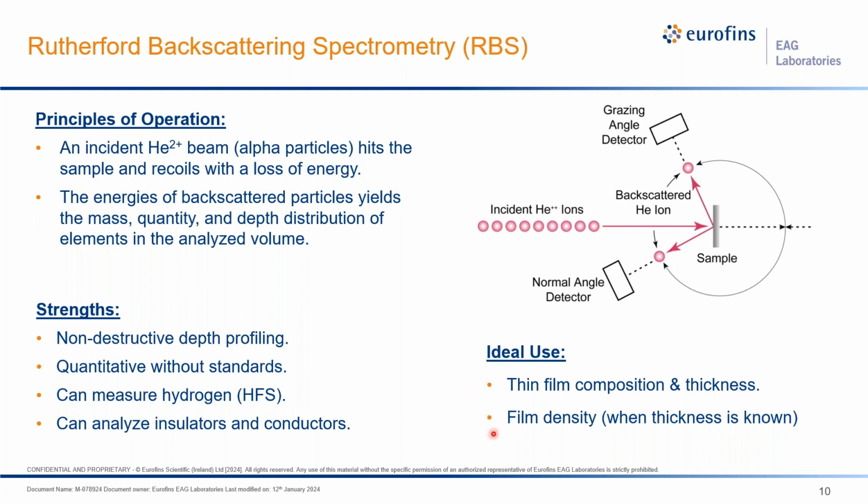It is also good for measuring the density of such films if one has a good measurement of thickness. RBS essentially gives a depth profile completely non-destructively. Its accuracy is very good. It is quantitative, but does not require a reference standard. RBS is actually used to develop reference standards for several other techniques.